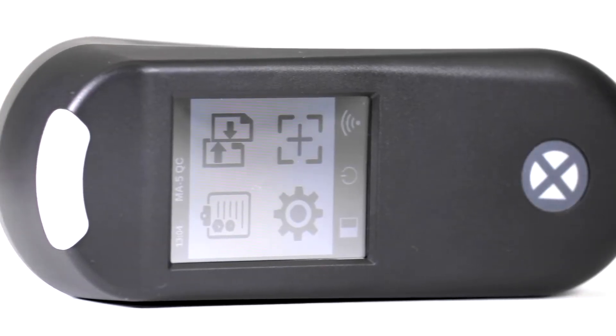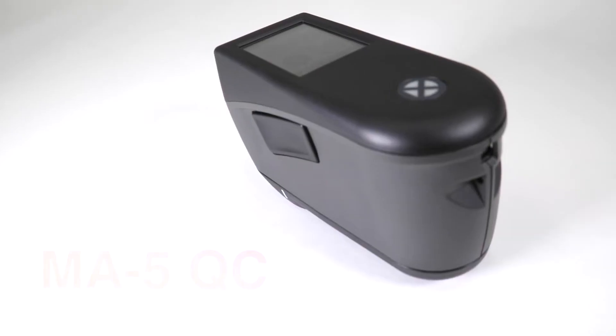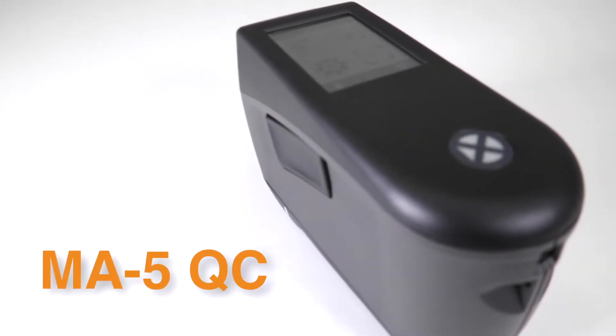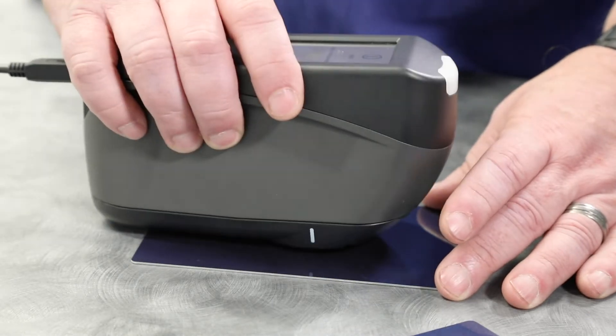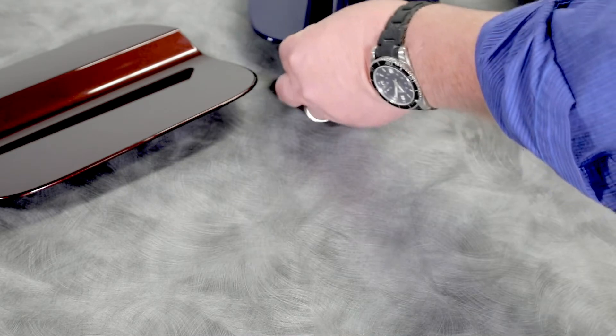Compact. Intelligent. Accurate. MA5QC. The lightest five-angle spectrophotometer on the market. Designed for consistent quality control and color measurement of effect finishes in the lab, on the production floor, and in the field.